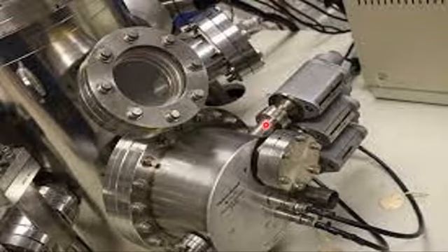Now students, I have briefly explained the different types of interaction which an electron beam has with a sample surface, and on the basis of interaction there may be reflection, emission, absorption, or transmission of the electron beam.